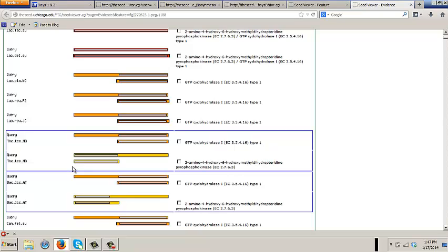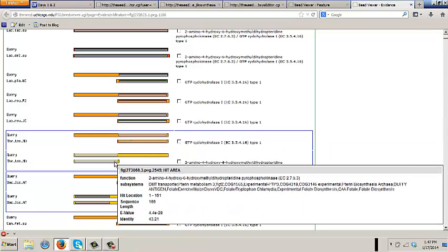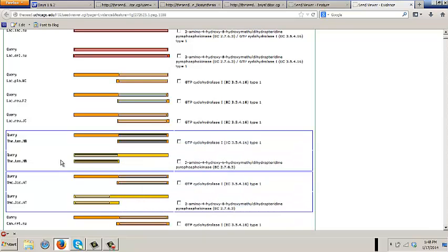We knew it's interesting, it's a fusion, it has two domains. But interestingly, in other creatures, in this Thermoanaerobacter, whatever is fused in the Lactococcus appears as separate genes. This gene has ID 2547, and this one 2545. So you can see they're next to each other. In the genome of Thermoanaerobacter, just by looking at the IDs of the homologues, you can see that they are next to each other, 2545 and 2547. They're not completely adjacent, they're close, but they're separate genes, and somebody got in between.